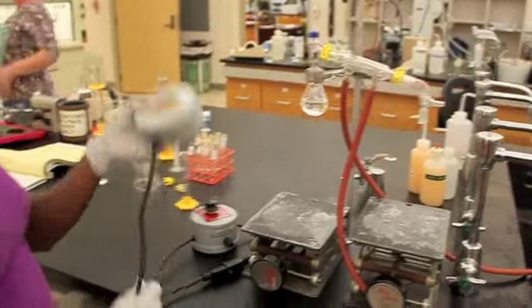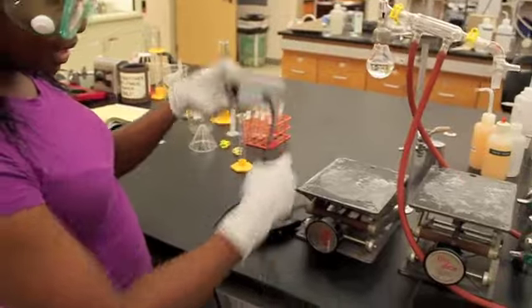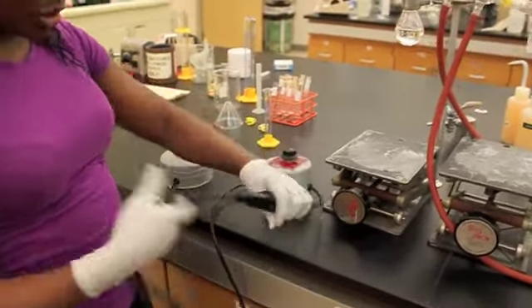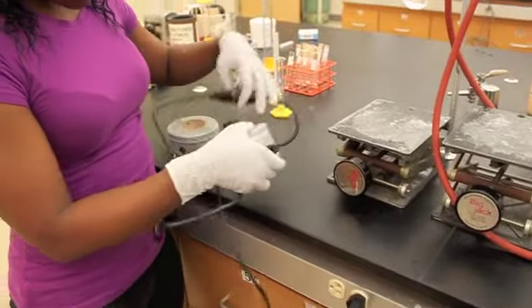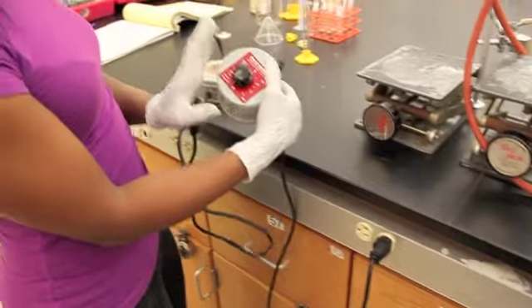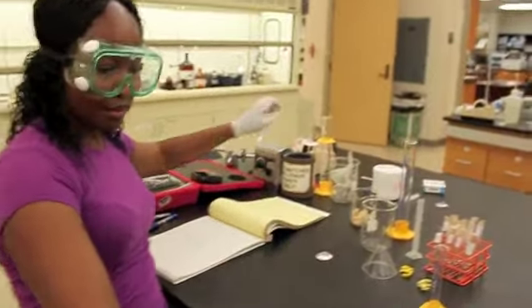As you adjust your apparatus, you will have the heating mantle, which is a 50 mL heating mantle. Make sure your apparatus is on a jack, and you'll attach the heating mantle to the variac. The heating mantle will be attached to the plug here. You can either use this variac, or you can use the variac here on the table.